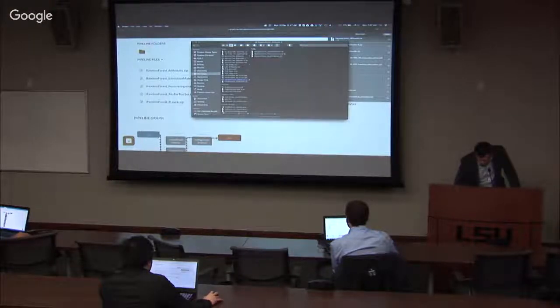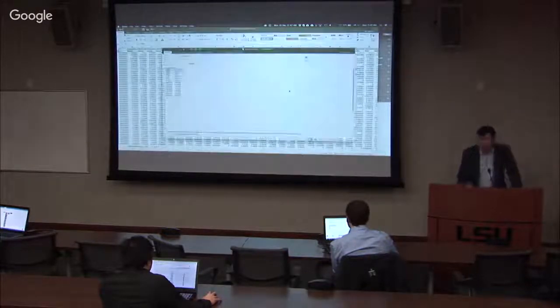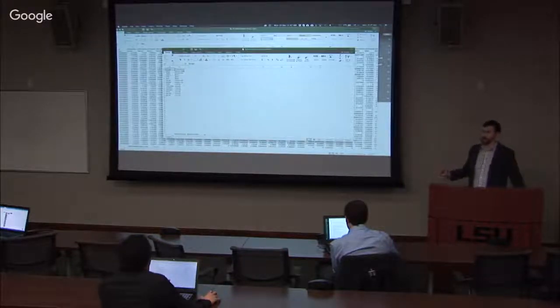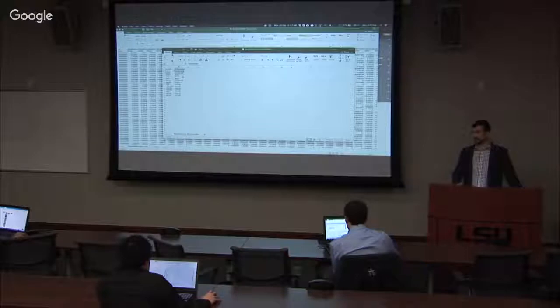So first of all, it is going to give me prediction for the classes, right? So I gave it in my training set for this data set, I separated them so that not all the same samples are in both tables. So I want to know here whether it did an accurate job. So this prediction right here is the predicted class from the training data set on a data set that Random Forest did not know anything about, right? So if we go back and check, we will actually see that it did a pretty good job, did perfectly what we told it to do.